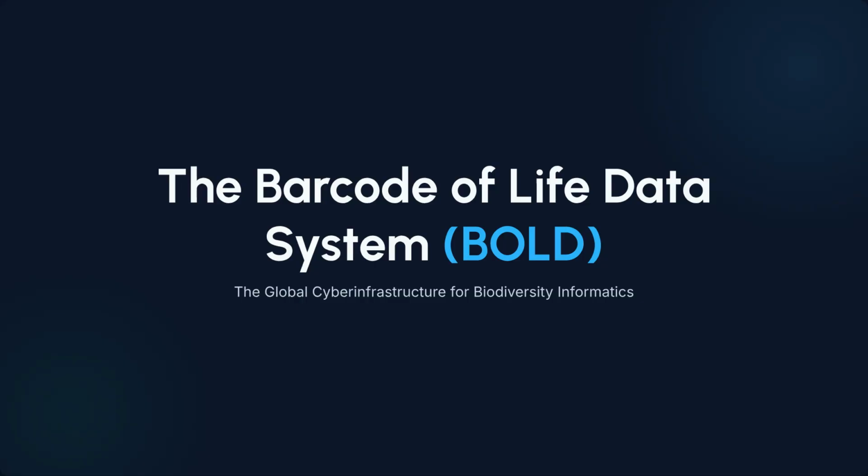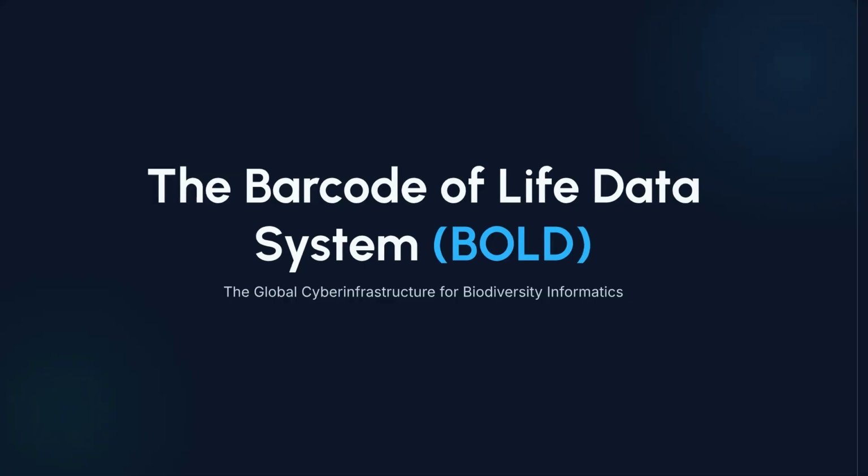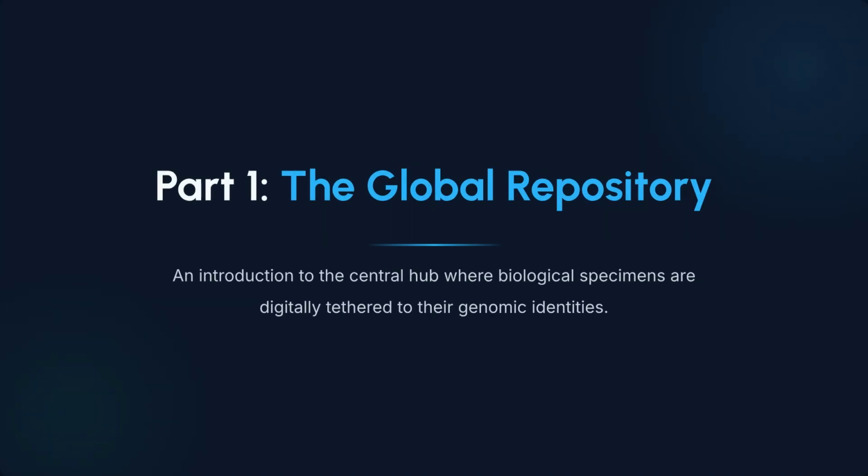Welcome to this video on the Barcode of Life Data System, or BOLD, a global cyber infrastructure designed for biodiversity informatics. We begin with Part 1, the Global Repository. This is the central hub where biological specimens are digitally linked to their genomic identities.